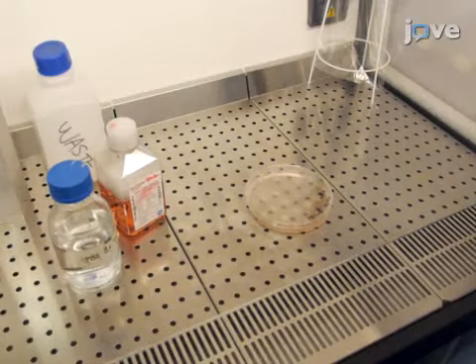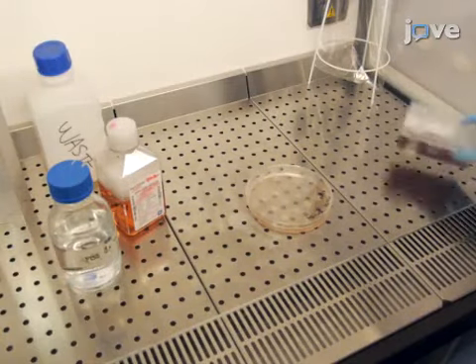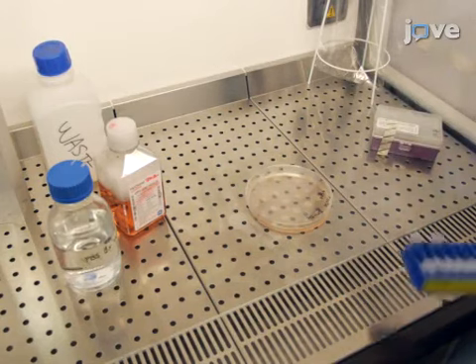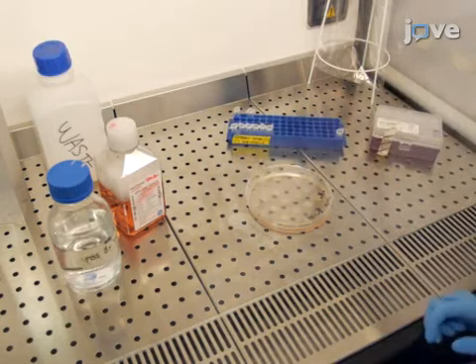Note that all the procedures described in this video should be carried out in the hood, using only sterile media, instruments, pipette tips, and culture dishes.